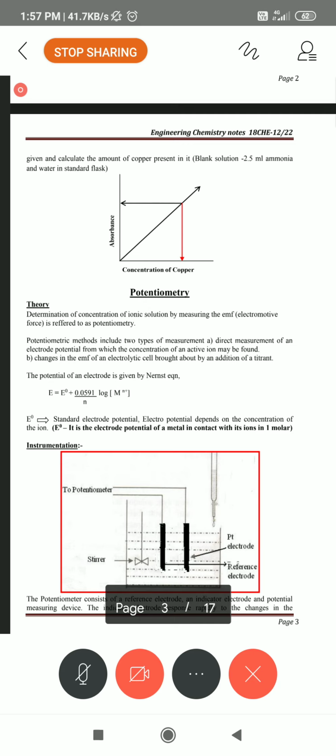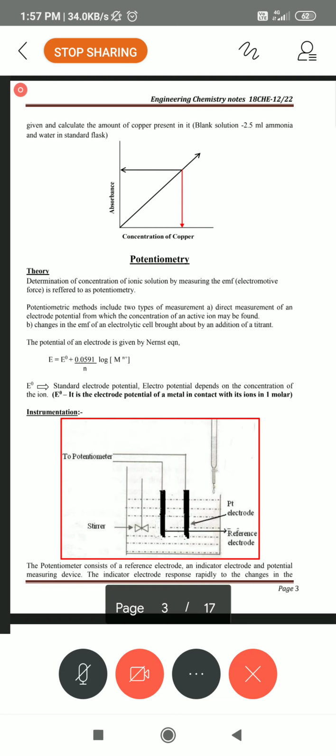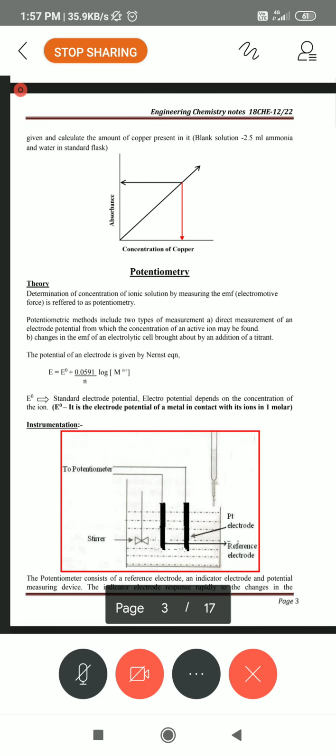You may define colorimetry in one line. Any type of explanation is acceptable: it is chemical analysis through the measurement of light radiation absorption in the region of the visible spectrum, with known concentration of the substances. What is there in the DM water, we are not going into that. How much light absorption takes place, we know definitely. How much copper sulphate is dissolved, we don't know.